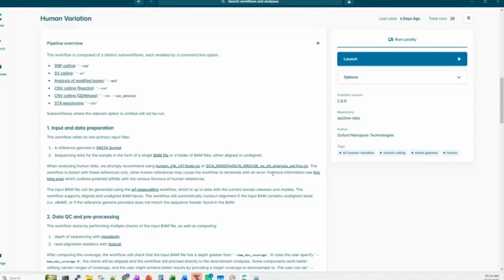So when selecting the data from NCBI, UCSC or Ensembl, it's better to choose the one without the alternate contigs, because the alternate contigs are going to make it complex when we want to map our data against reference genomes that have multiple alternate contigs, where the software might have problems identifying where the reads should be mapped to when there are multiple sequences that are very similar in terms of their sources. So this is where we can get the reference genome.